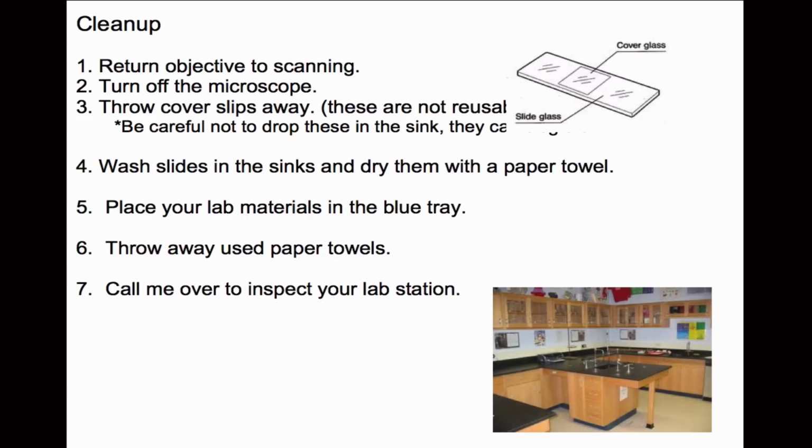All right, to clean up after the lab, you want to return the objective to scanning. So you're going to return that objective to the smallest one and turn off the microscope. That's really important because we don't want to burn the bulbs out.